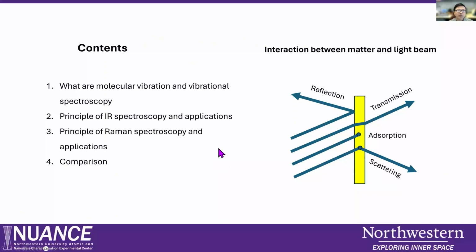Okay, so first I'll talk about the molecular vibration, and then vibration spectroscopy, because both Raman and FTIR are vibration spectroscopy. And then we talk about the IR principle and the Raman spectroscopy principle and their comparison. So both these techniques use light and interact with material.